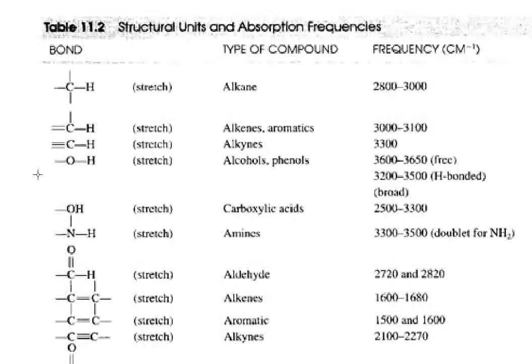Now, the next entry is carboxylic acid. Note this, the values listed here, 2500 to 3300. That's not just a range within which a narrow band falls, but rather that is the average width of the OH peak, the OH stretching peak in the infrared spectrum. Now that is extremely broad, and this is the broadest peak that you will find among all possible peaks in an IR spectrum. In fact, I like to refer to it as the camel's hump in the IR spectrum, because it's very characteristic that looking for that camel's hump can help you to identify a carboxylic acid when you have it.